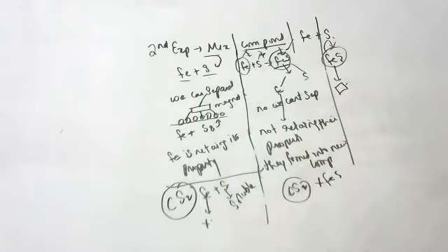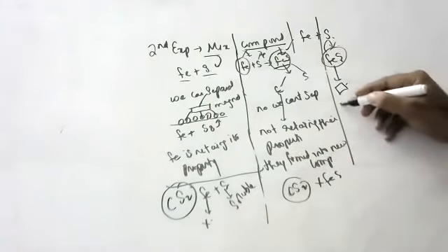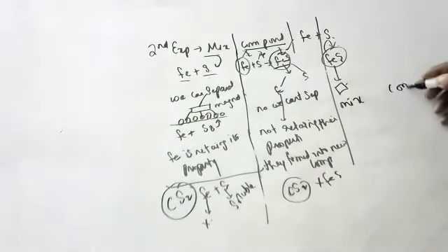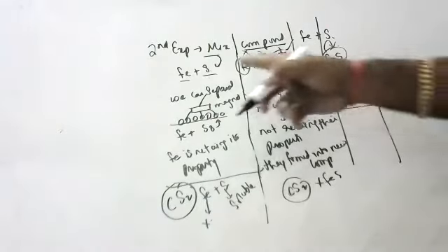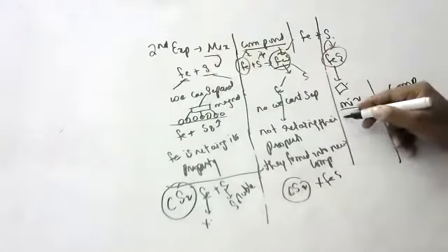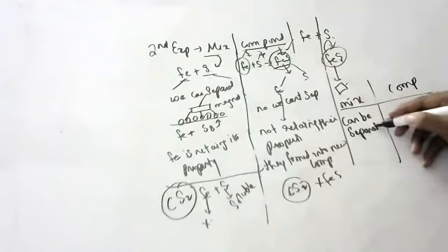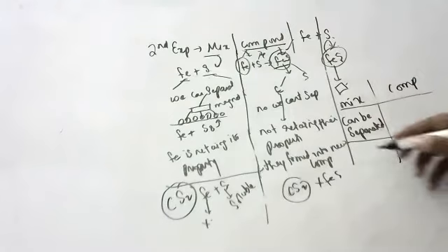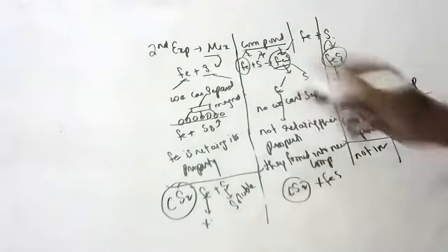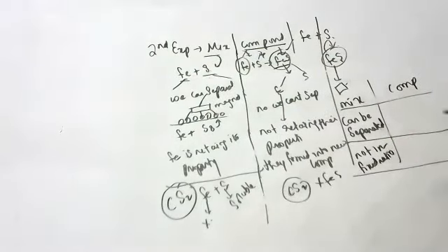So finally, children, I want to give you the differences between mixtures and compounds in this activity using iron and sulphur. What are the differences, children? In a mixture, components can be separated physically, and constituents, iron and sulphur, are not in a fixed ratio. Try to understand, children.